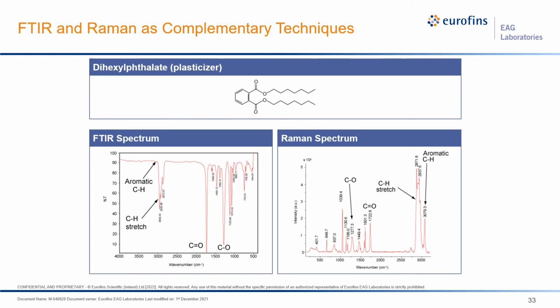Because Raman is much more sensitive to the aromatic peaks. The aromatic peaks here, you can see they're just a series of carbon atoms connected together. They have quite a bit of symmetry. And so Raman will be much more sensitive to aromatics rather than carbonyl. But in general, the spectra have a lot of similarities, and oftentimes they provide the same kinds of information.